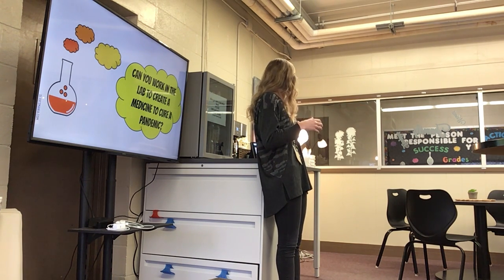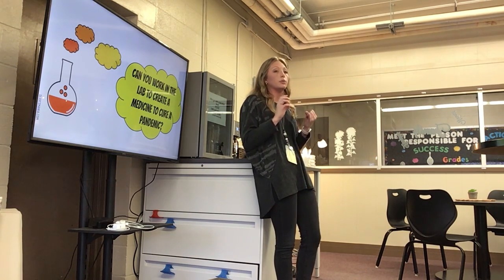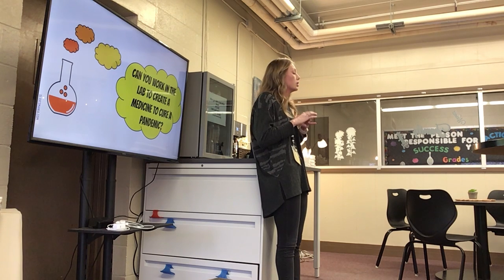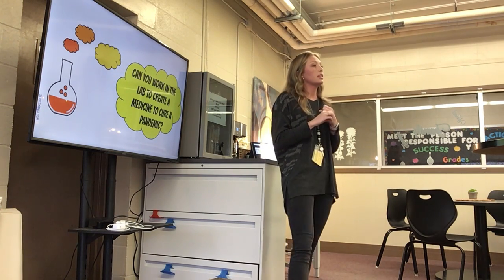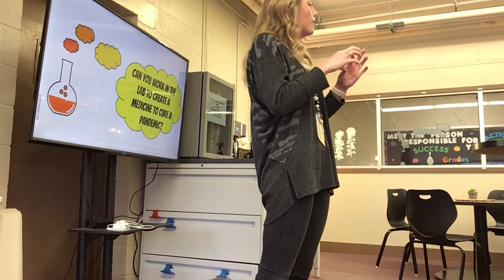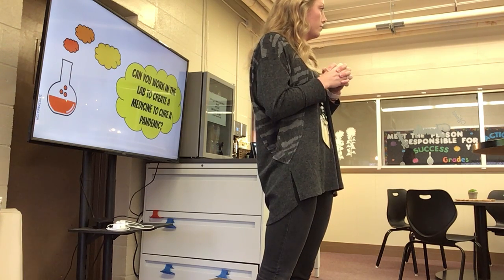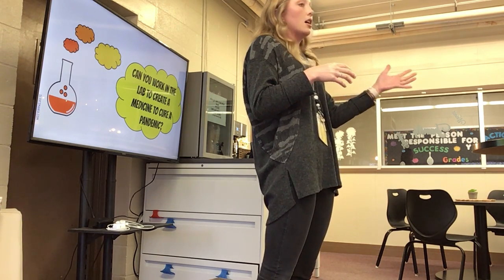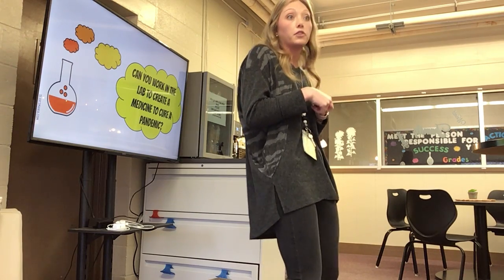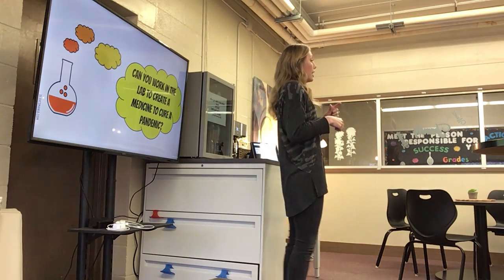So today you're going to be working in the lab creating compound solutions and mixtures. I'm going to come around and help you record your data in charts and graphs and make sure we are making observations along the way. One big thing I want you to look for: after you mix something, it might look one way, right? After you let it sit for about 2 or 3 minutes, what might happen to that solution? It might separate. It may clump together. It may put off an odor, okay? So I want y'all to all observe over time and see what happens, okay?